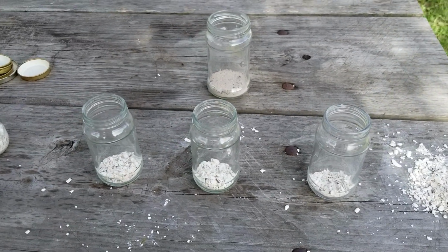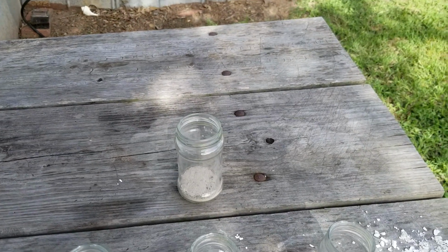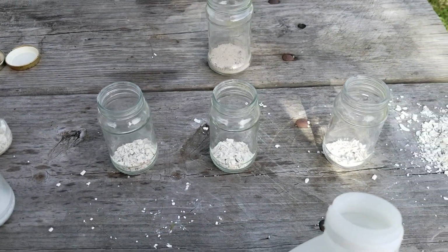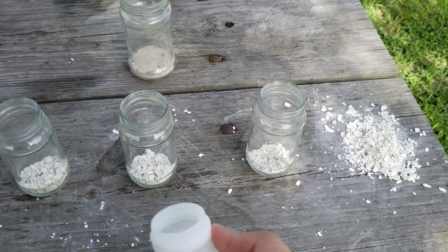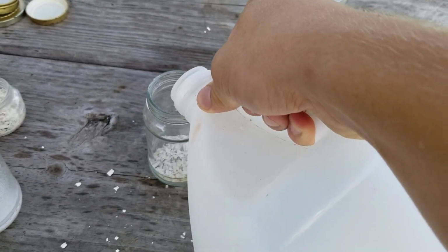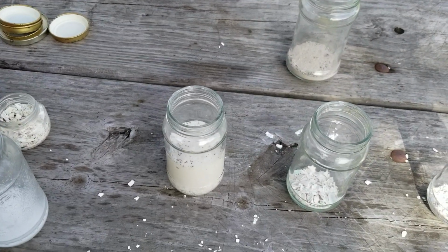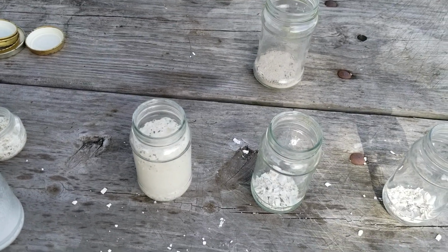And this is an example of choosing the proper acid, because some of these products are not very soluble. So for example, and I will say that calcium carbonate is also the component that is in Tums and in eggshells. So if you don't have access to this specifically, you do have other examples of it in case you want to do it yourself. So here we're going to mix in vinegar first. And we see that it is bubbling, though slowly. It's not very fast at what it's doing, not near as fast as the baking soda.